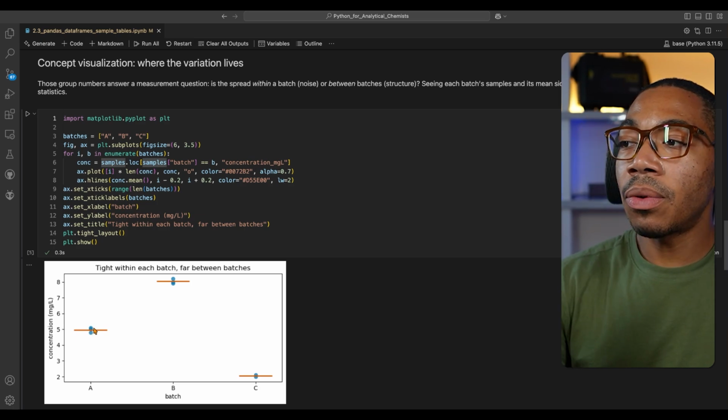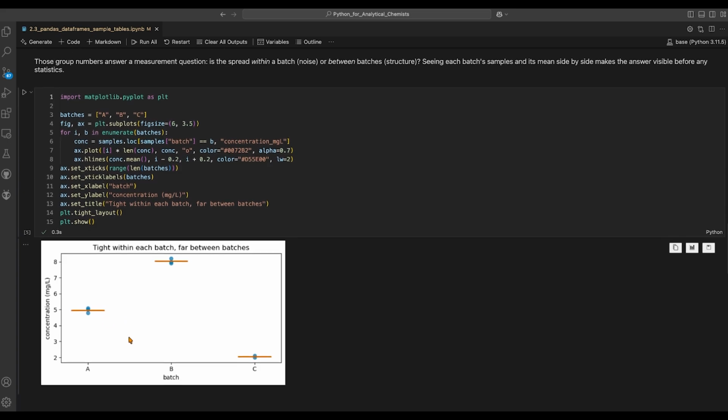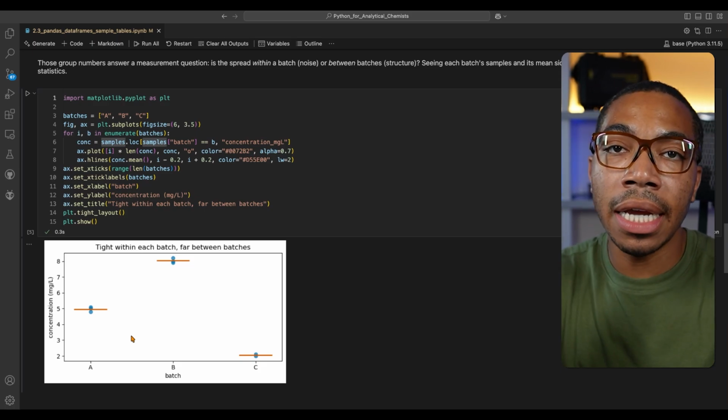And so we can see how these different batches perform next to each other, how spread the data points are within each batch, to not only assess the numerical outputs, but also the quality of measurements within each of these materials. So this would be really good for QCing both the materials, but also imagine if you're onboarding a new analyst and you want to see how tight the spread of their measurements is, maybe compared to an expert, to ensure the quality is in place.